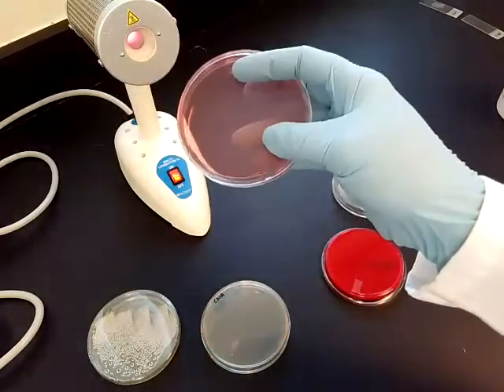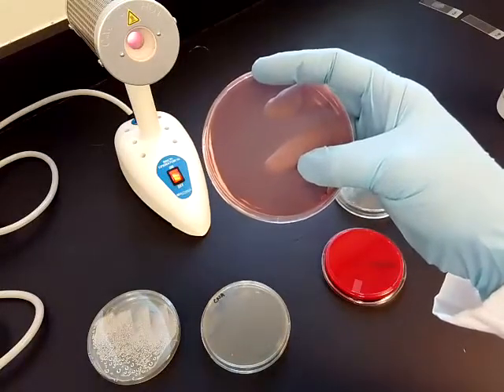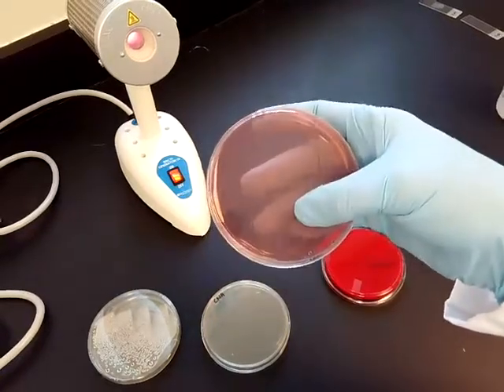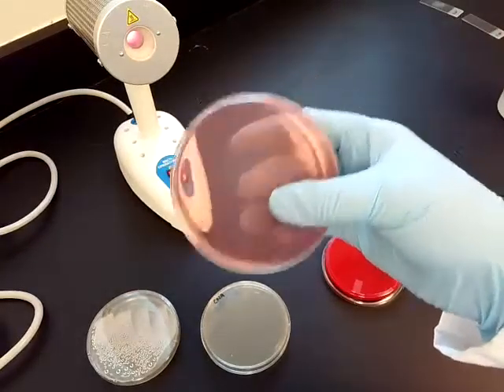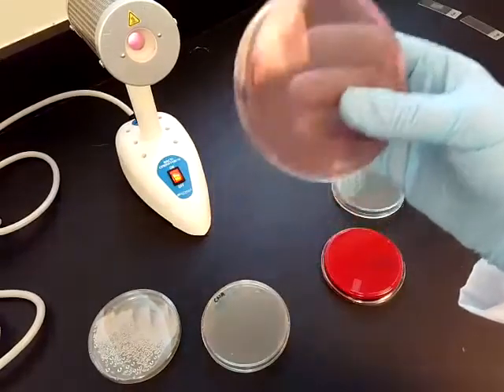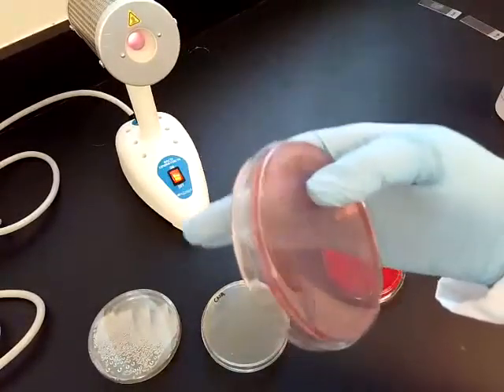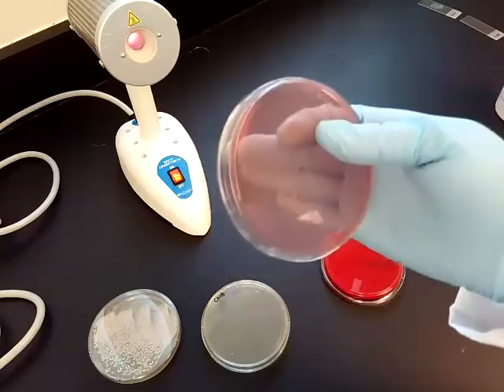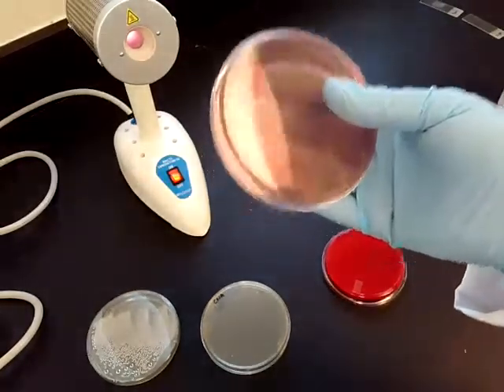This next type of medium is MacConkey agar. MacConkey is used to grow gram-negative microorganisms. It is both selective and differential. It's selective because it selects against gram-positives. And this is used for enteric pathogens. So the enterics, the ones that live in your gut and in your digestive tract, there's gram-positives and gram-negatives in there. Typically in your digestive tract, the gram-positives are going to be the good guys. Those are the probiotics and the ones that are going to protect you from these types of infections. The gram-negatives are usually the bad guys.